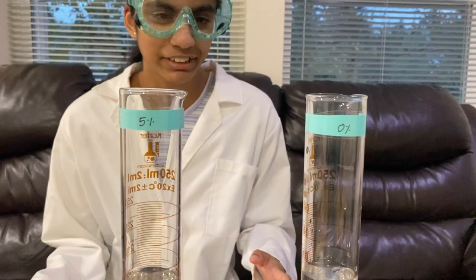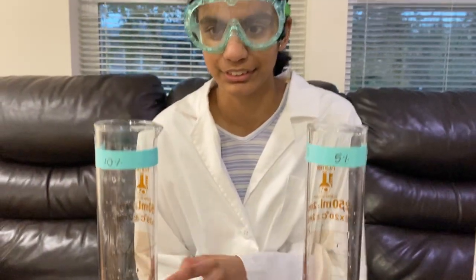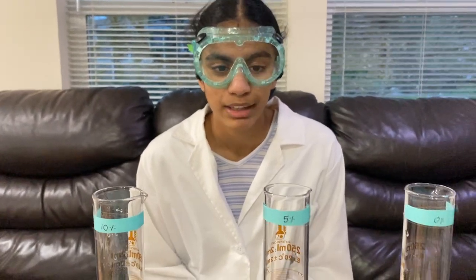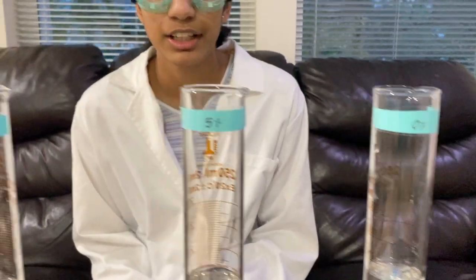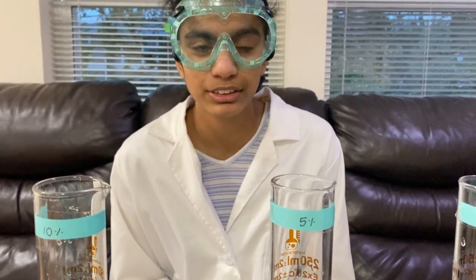Today, we will be testing our salinometer by placing it in 0%, 5%, and 10% salt solutions. For my 0% salt solution, I used plain distilled water. For my 5% salt solution, I mixed 5 grams in a total of 100 milliliters of distilled water.